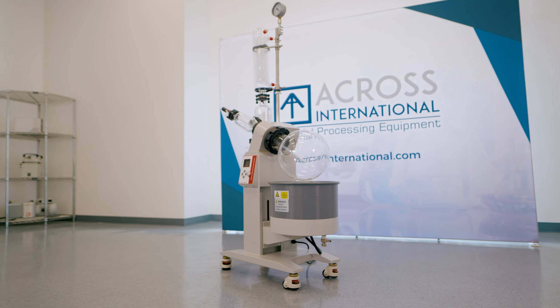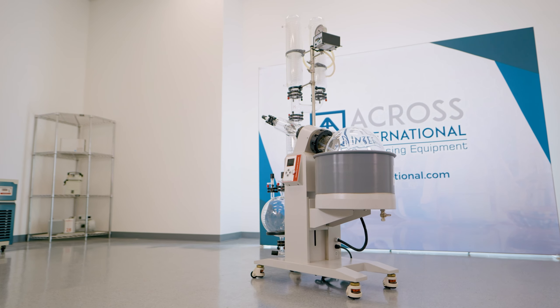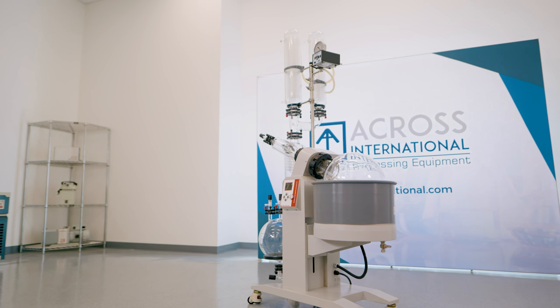These efficient and affordable units feature high distillation rates along with ease of operation. In addition to functionality, our rotaries are built with compliance in mind, making them perfect for CGMP facilities.